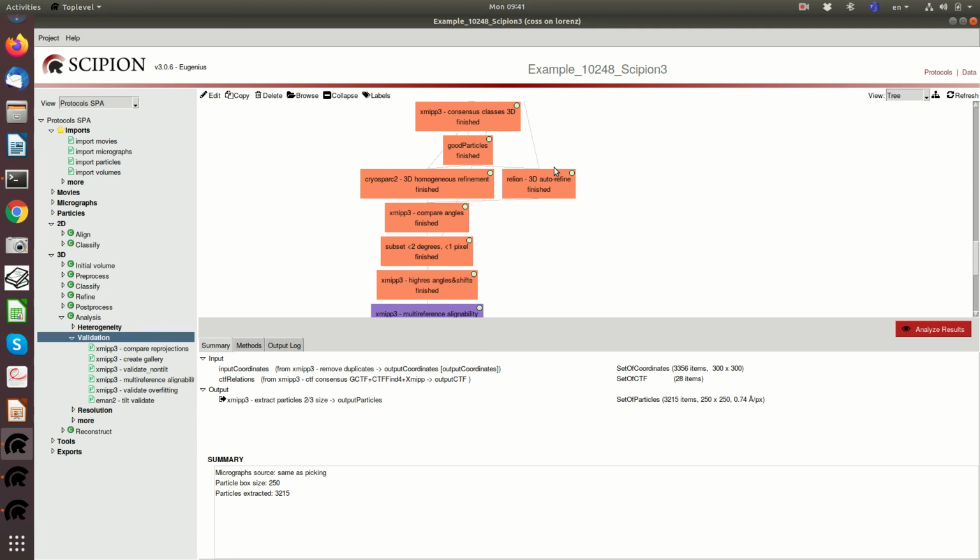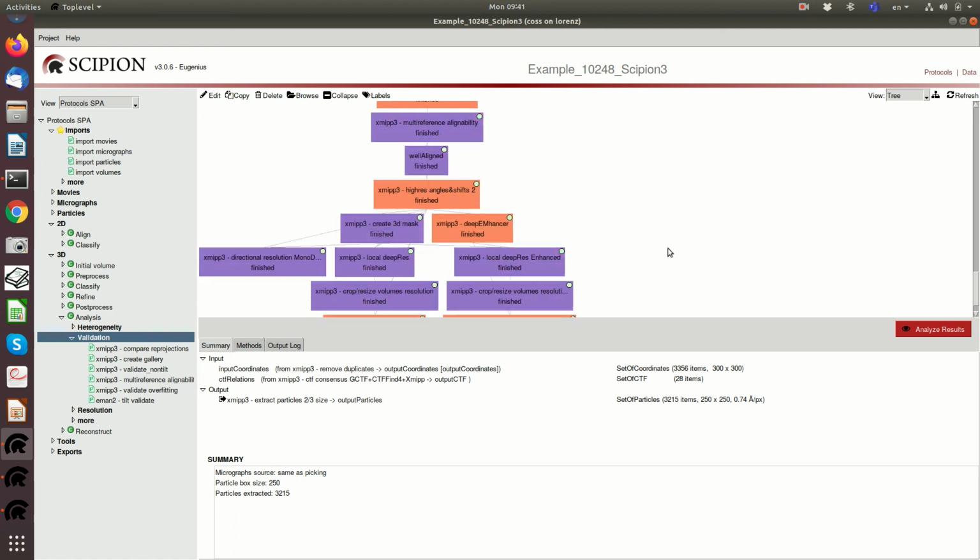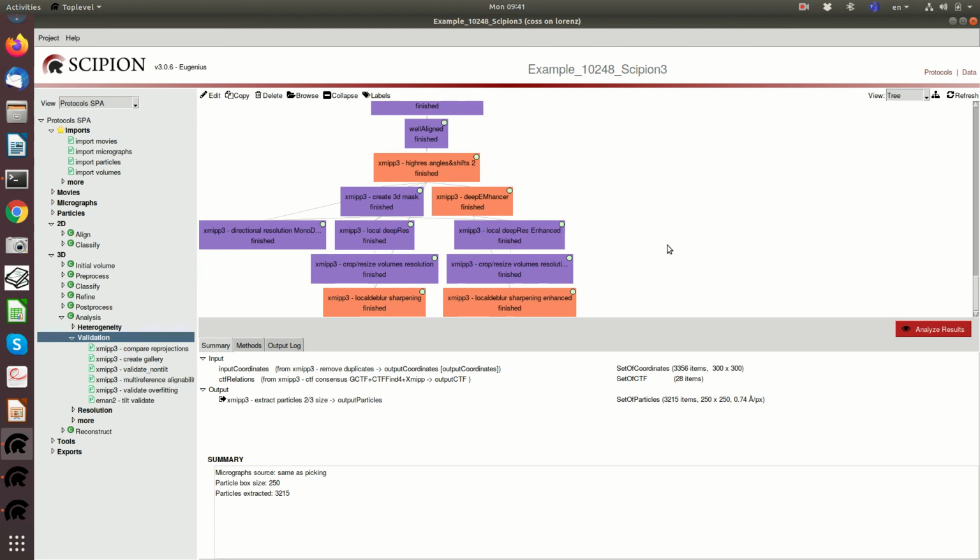Otherwise you are bound to believe that whatever single algorithm you are using is always making the right choice with absolutely no noise, and that is impossible. That doesn't exist. Not even XMIPP, no other algorithm has no error. So unless you can be absolutely sure that what you are estimating is the right thing, you can never be absolutely sure about any fine detail of your 3D structure.